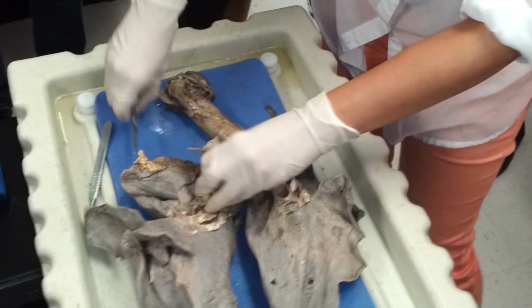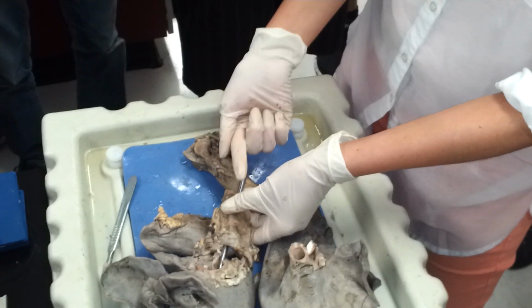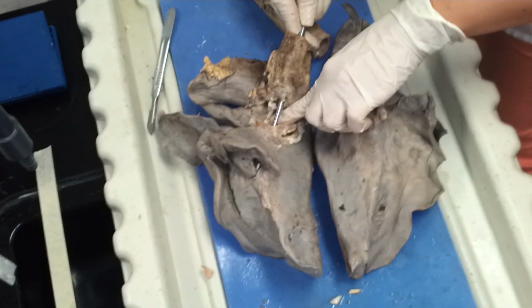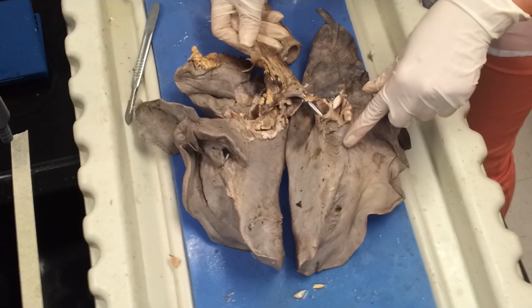Now, this is just to show you. It's not going to be a question, but imagine that the air is coming in through the trachea and jutting into the lungs. So right here, that's the primary bronchus. And same goes with this, primary bronchus.